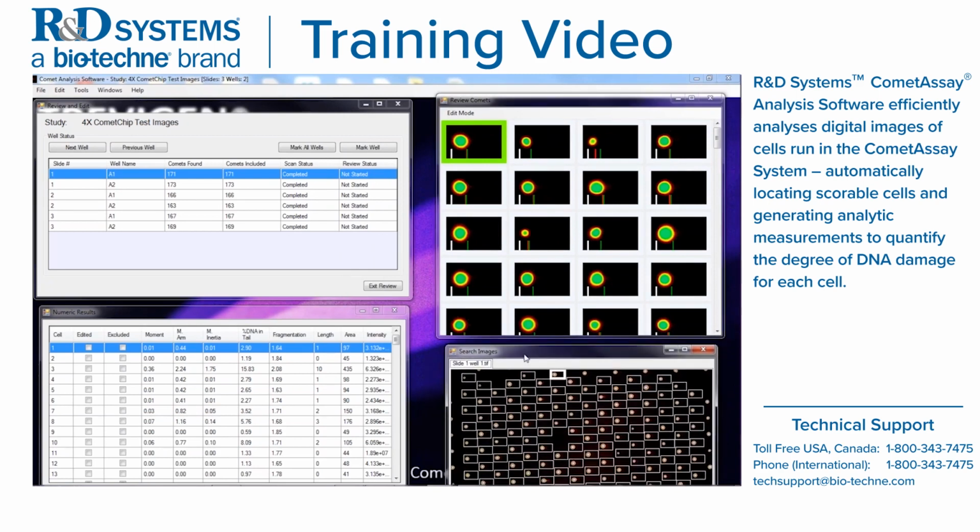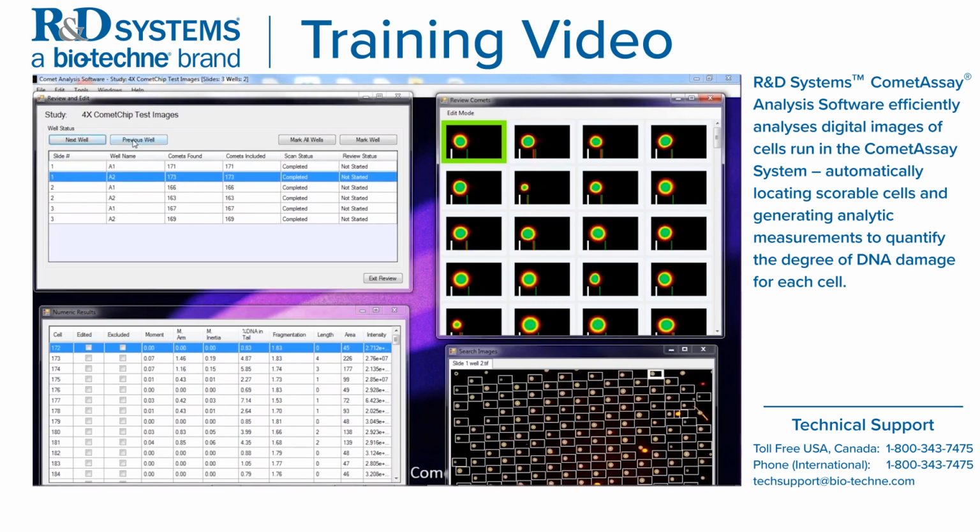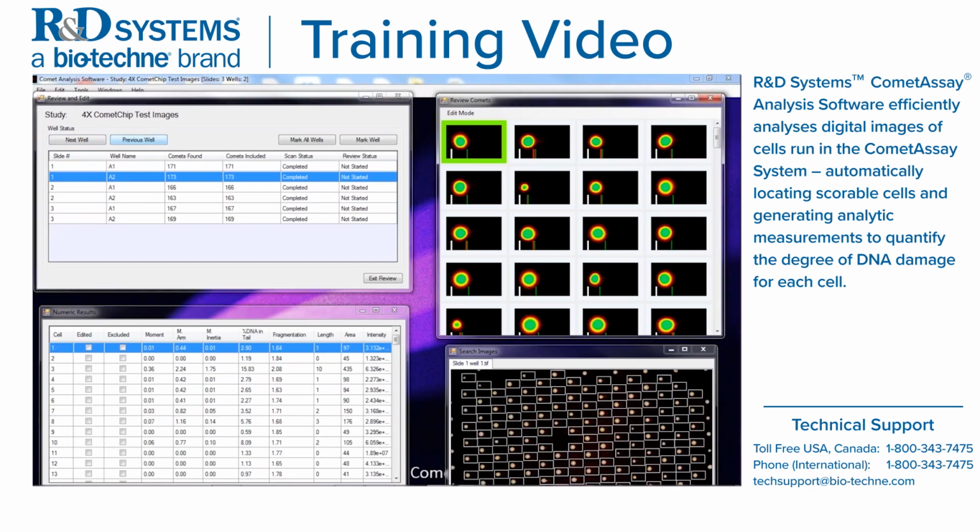So let's first talk about what each of these screens are. The Review and Edit is really your broader summary window. Again, it's giving you the study name. This is the one that's going to allow you to move between slides and wells. You can just toggle next well and go back previous well.